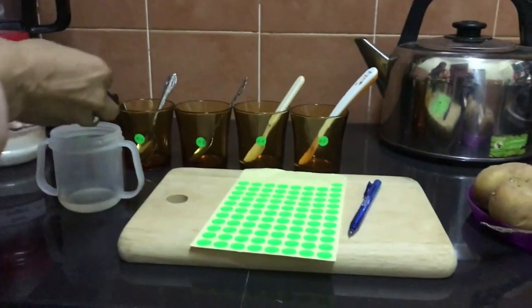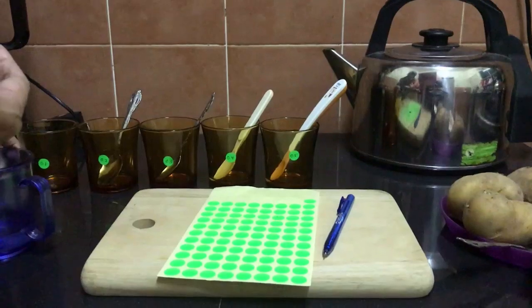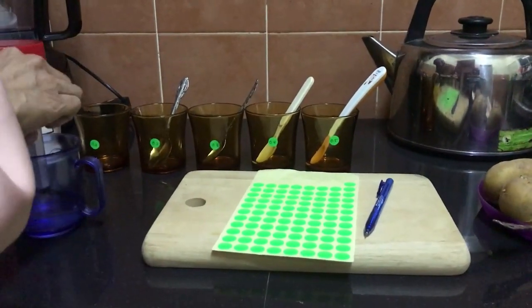Now you need to dilute the solution with tap water. We need to prepare a final volume of 20 ml solution.